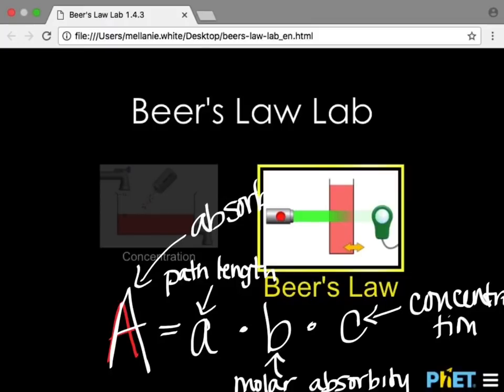So what happens is, we're going to use a spectrophotometer. When I used to work in the labs, a spectrophotometer was about this big, about this tall, and it has a little hole in there, that big. I would take blood cells or whatever and put them in there, then take another sample, and we would see how much absorbance was in each sample. And then we could figure out what the concentration is from that number.